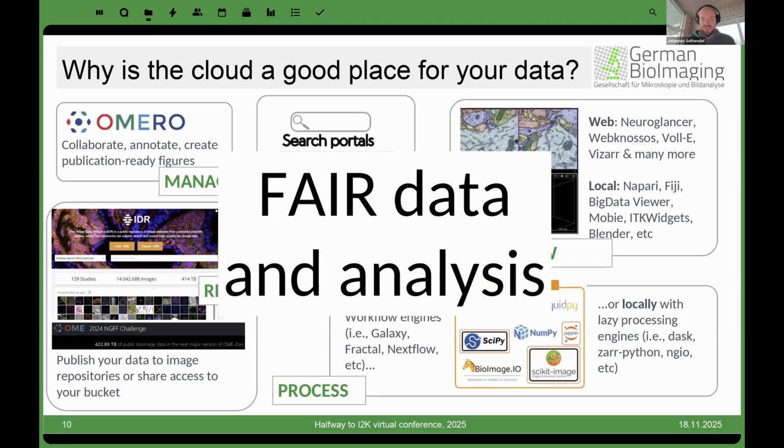And I think all of these together are, for me, a bit the essentials of what makes data and analysis FAIR. Your data can be findable, it's accessible in a shared protocol, it's interoperable, many tools and a huge community of tools know how to ingest this kind of data. It is reusable because it follows the specification. Others can make use of the data for reanalysis, give a few more citations to your publication where your data came from, which I think is really neat.